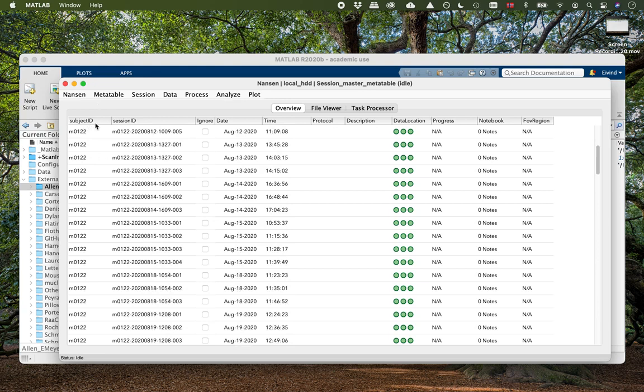The session contains a set of variables. These are default variables that will be added for every session, but it's also possible to create custom variables. The FOV region at the end here is an example of a custom variable, but we can make as many as we want.